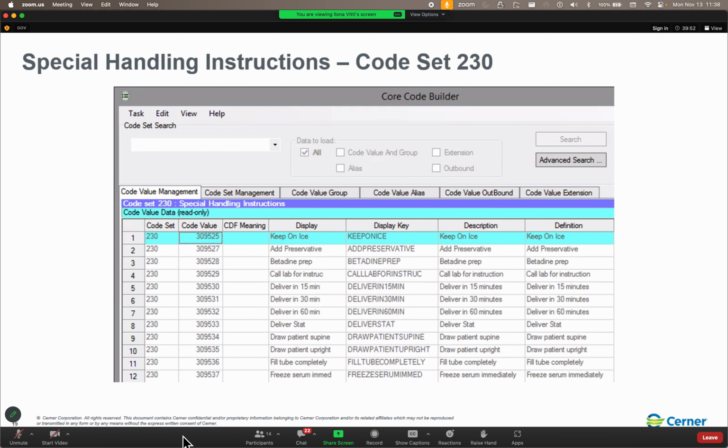So if you wanted to, you could create an accession class out here. And then I suppose you could go back to the accession setup tool and change the accession format that's assigned. Now, thankfully, we're not creating new accession classes every day. So this is usually a set it and forget it scenario. Unless you're micro, unless you're radiology, in which case you're creating unique accession classes for each of your orders. So does anybody have any questions about accession classes, accession formats, the relationship?